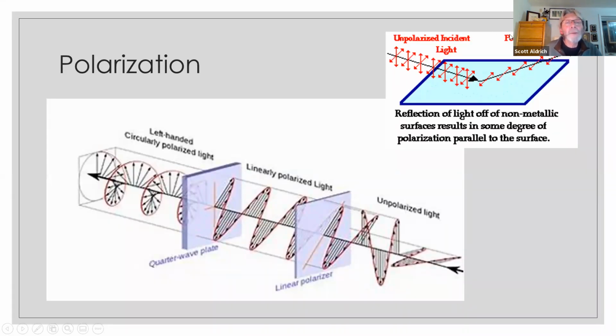And so here's a diagram of polarization. As I showed before, this schematic's a little bit different, but unpolarized light is vibrating 360 degrees around that propagation line. It passes through a polarizer, and now it's all aligned. The only thing that gets through is this vibration direction. So right away, we've lost some light intensity. And at this point, we can use it to analyze our specimen.